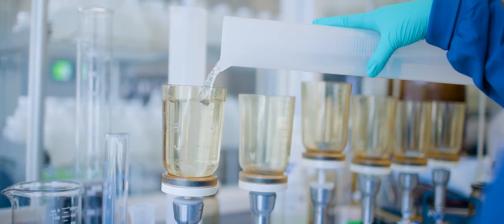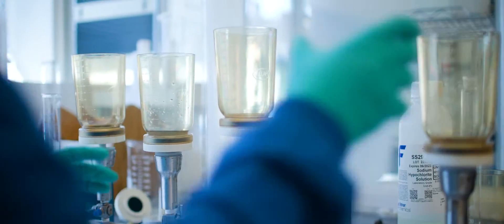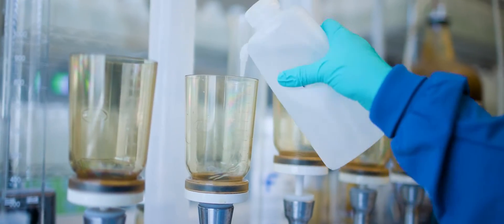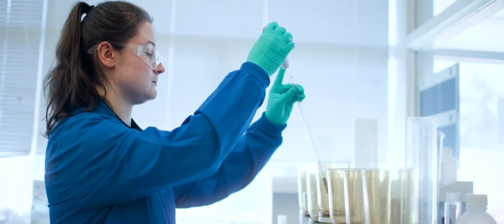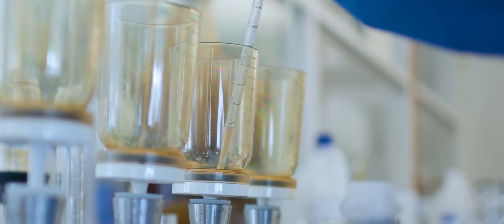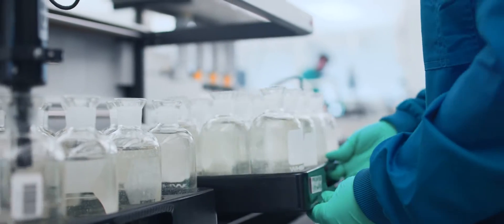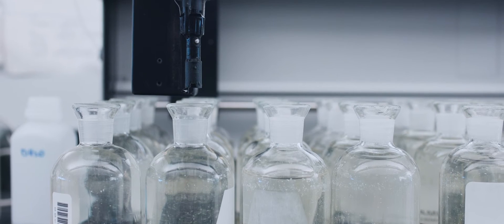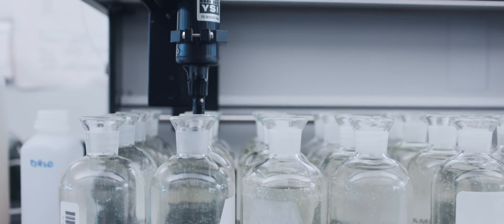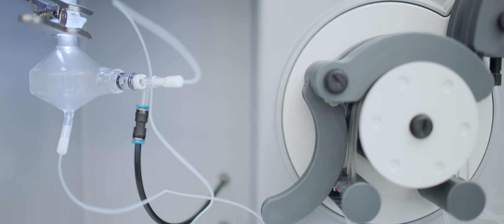Every plant, every day. Kimberly and her colleagues perform about 500,000 tests each year. If you took a science class in school, it's very similar to that. We have a lot of really cool instruments here that are highly precise, and having access to them—not a lot of places have access to having some of the best in the industry.